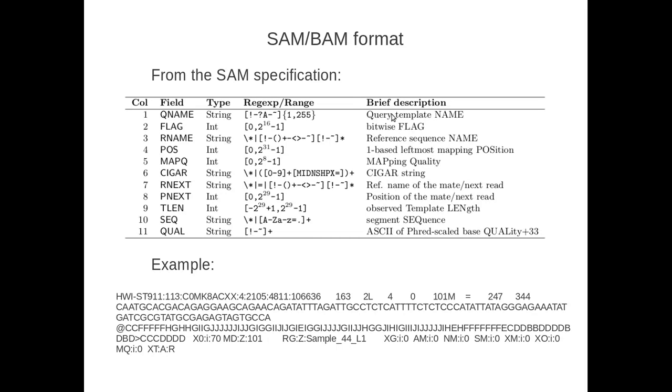In cases where the focal read information differs from the same information in the mated read, the fix mate information will go through and correct that by extracting the focal read information of the RNAME and the position data and going to the mated read and fixing in that information in the RNEXT and PNEXT.